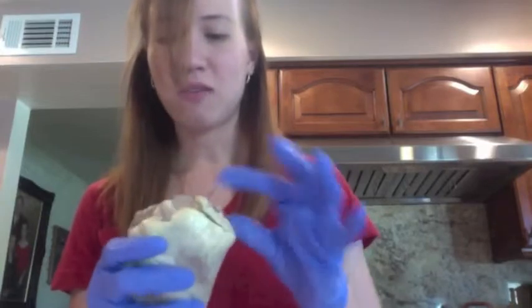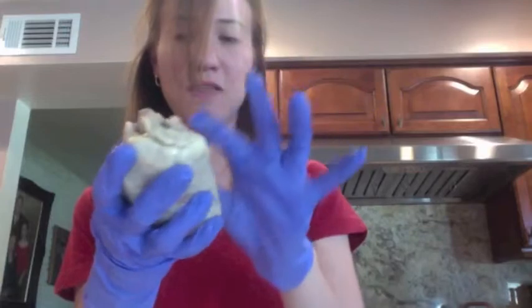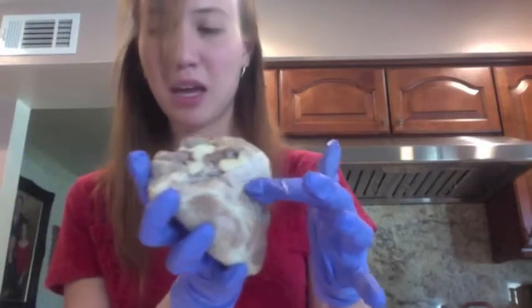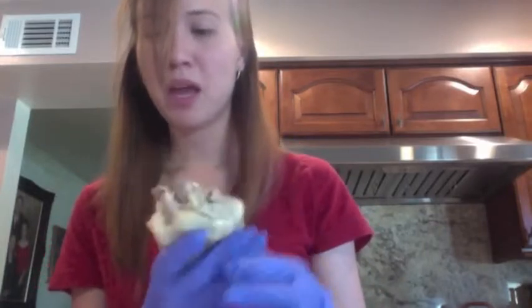And then we have our superior vena cava here. Inferior vena cava would be right about here on the back. And we have our coronary sinus, which runs this way. These blood vessels deliver blood to the right atrium, and they are made out of veins, and the type of blood that they carry is deoxygenated blood.